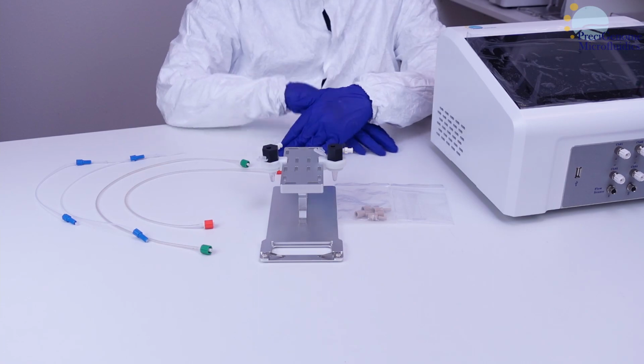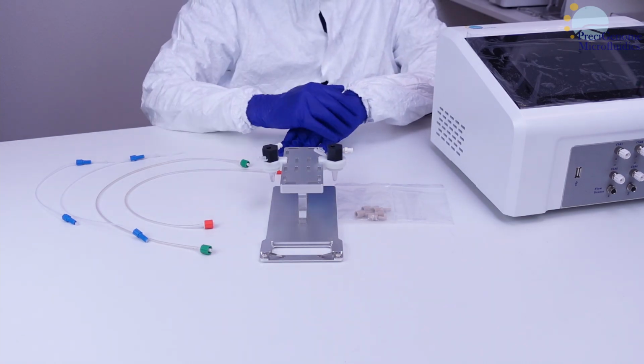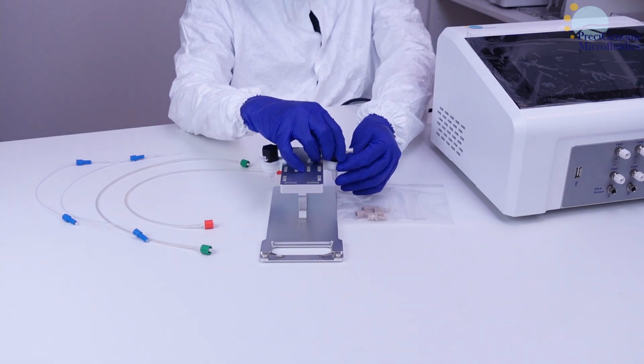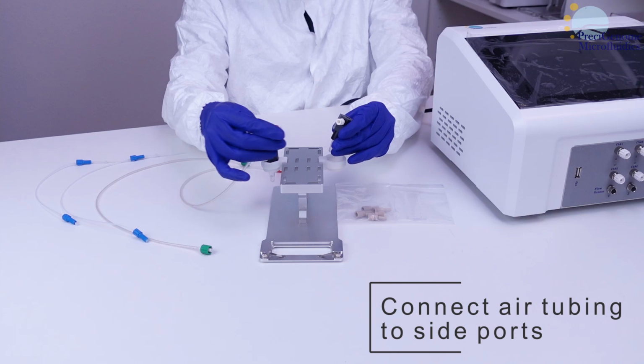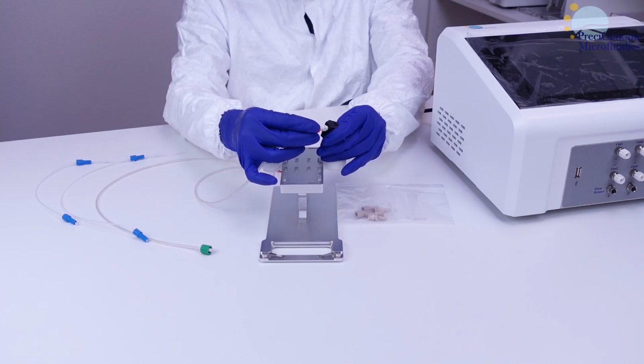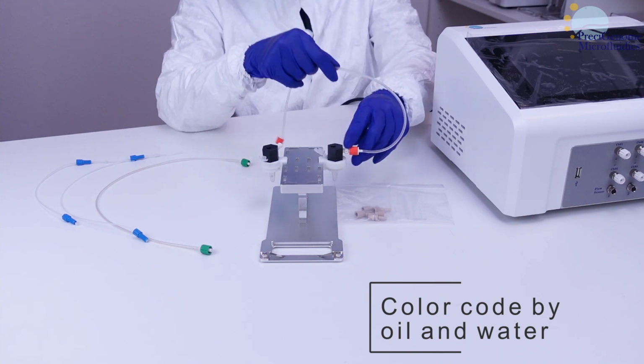In this video, we will show how to assemble a droplet generation setup. Start with your reservoirs. The side ports are for air, so connect them to some Tygon tubing. We recommend color coding so you can distinguish the oil and water reservoirs.